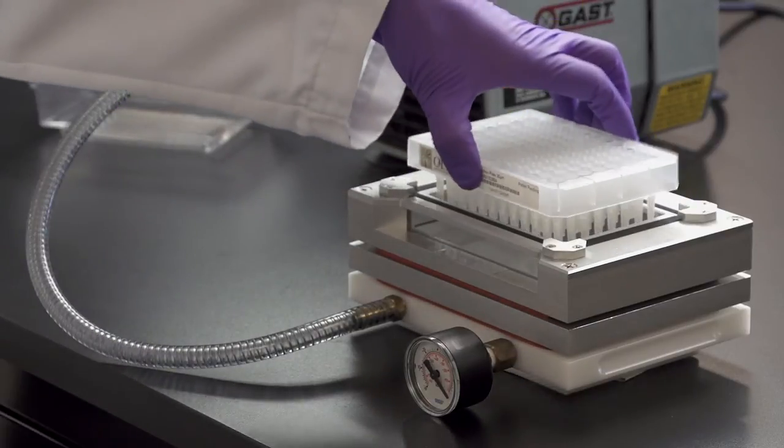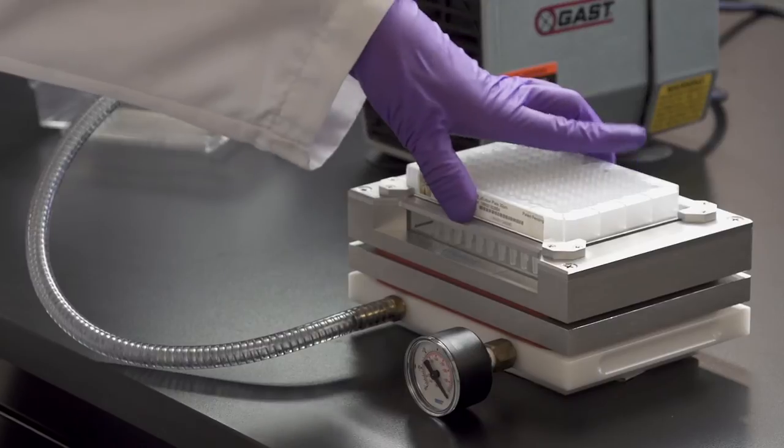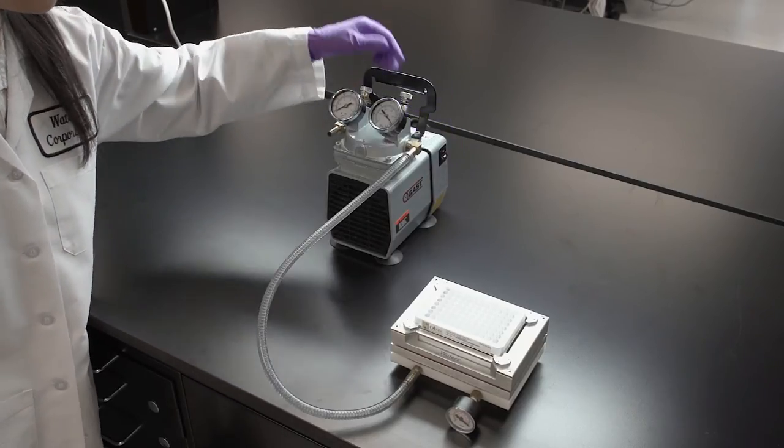Place the plate on the top of the manifold, ensuring good seal on the gasket. Set regulated vacuum source to zero.